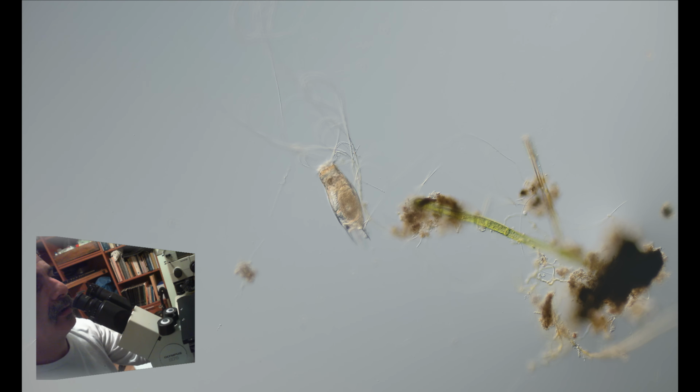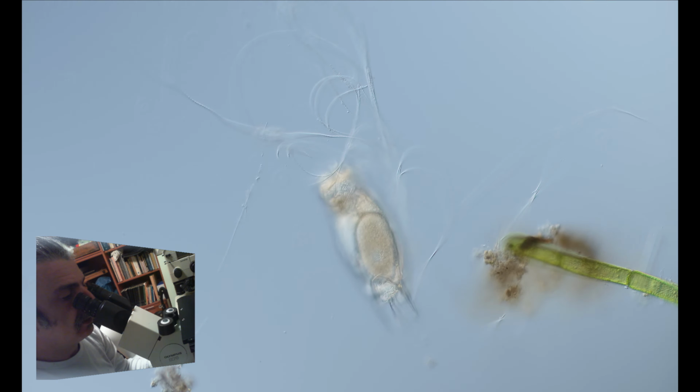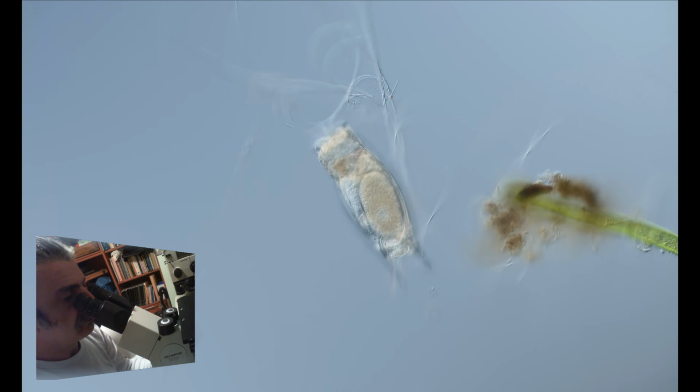Let's get back to 10. Okay, here's a nice rotifer. Again, rotifers are multicellular creatures.